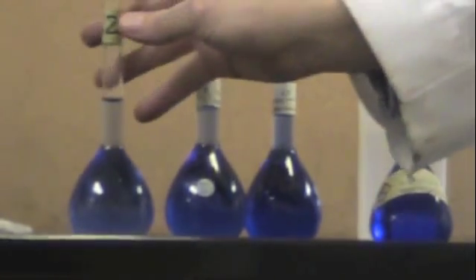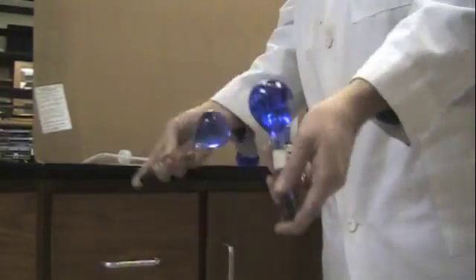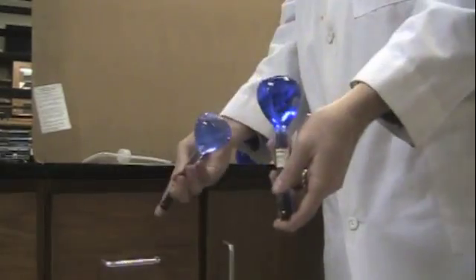After you get them diluted, you need to make sure your solutions are mixed thoroughly. So what you're going to do is stopper them with the appropriate size stopper and then you're going to invert and mix them like this. Invert at least 20 times. It's a good idea to hold your finger over the top of the stopper.